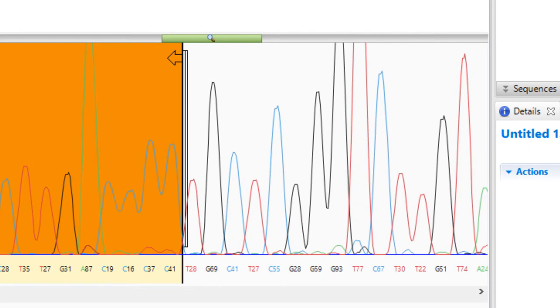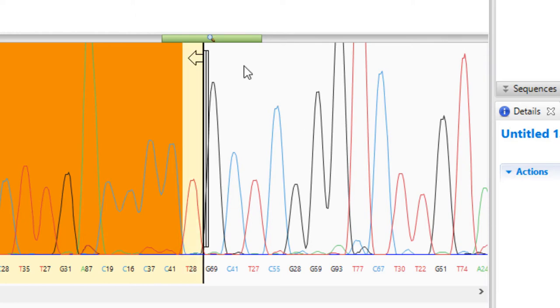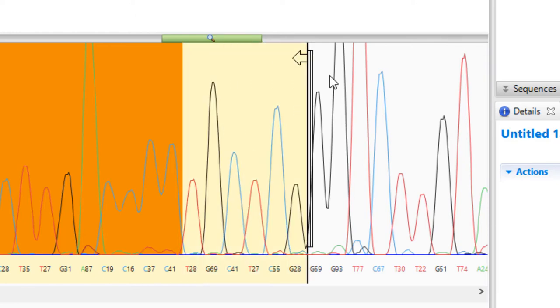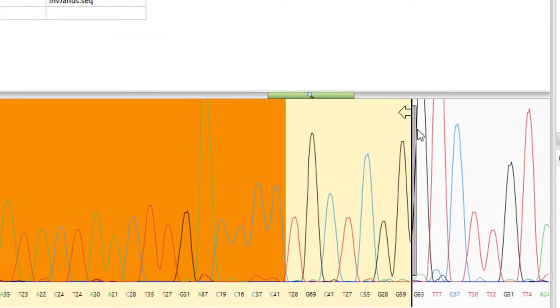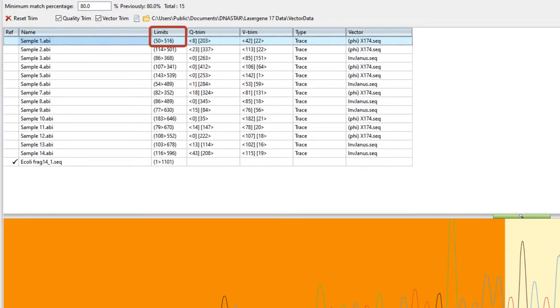To trim a sequence manually, grab the slider at either end of the sequence and drag it to the desired location. Any changes are reflected in the table above.